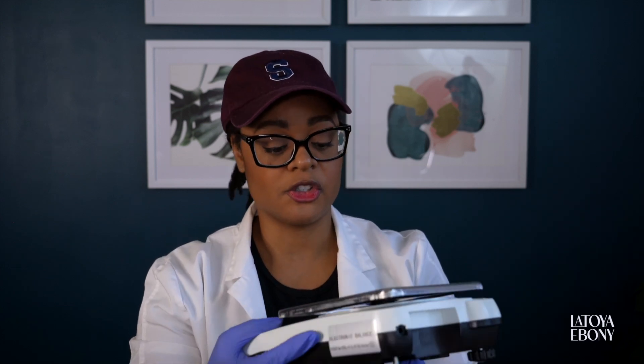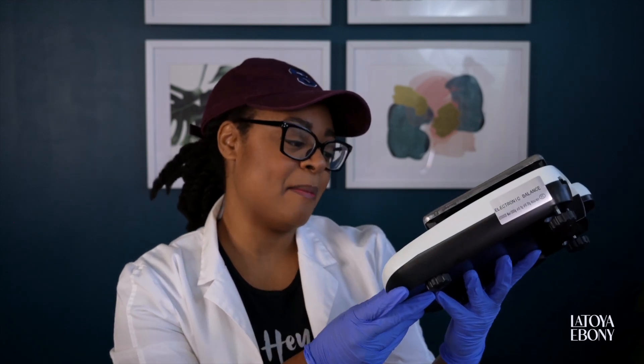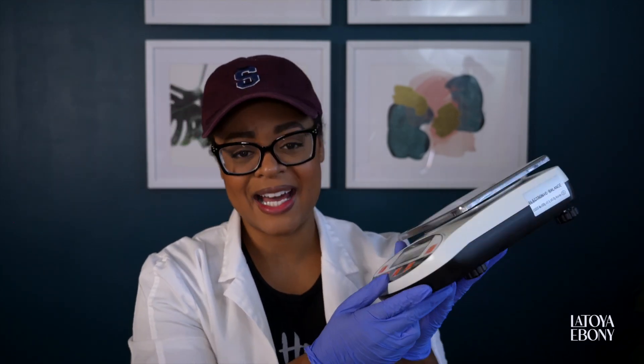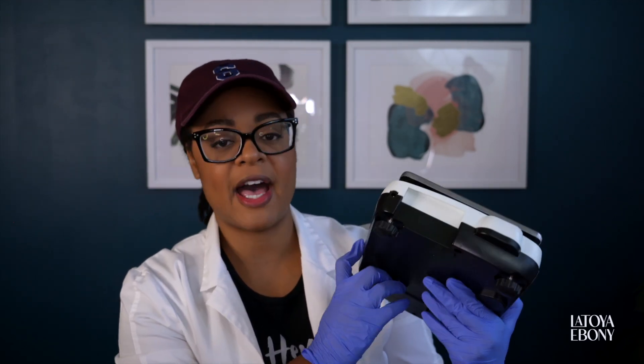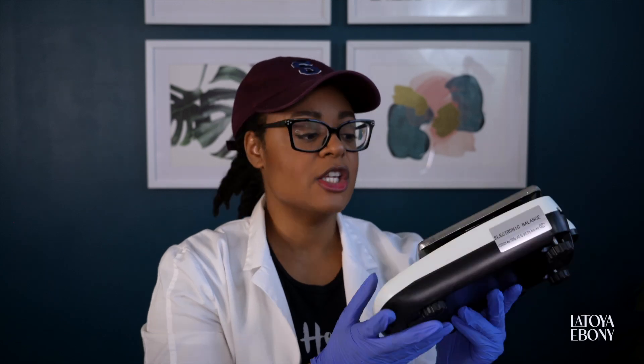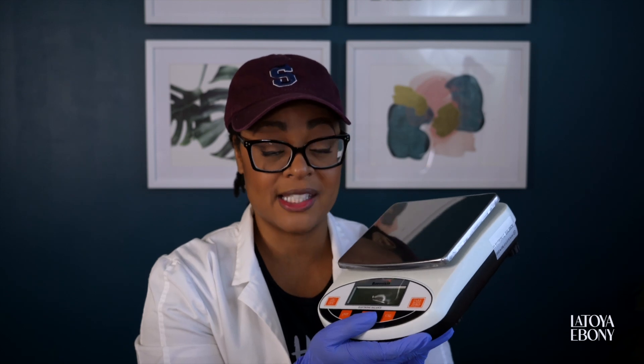One of the most important tools you can have in your lab is a scale. I don't do any of my measurements in ounces or pounds. I use grams and I measure by weight because that is the most accurate way to measure. So this is my new scale — it's by the brand Bonvoisin, I got it from Amazon, and it goes from 0.01 grams up to 5,000 grams. I chose this particular one as a secondary scale — actually a third scale that I have.